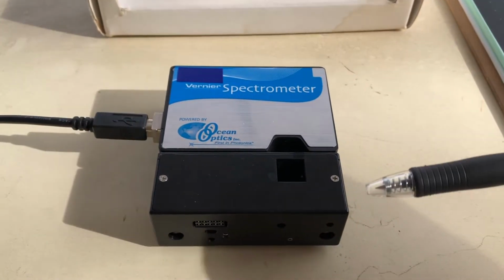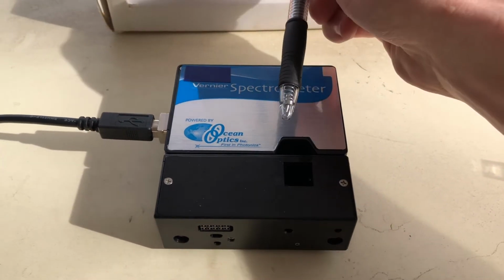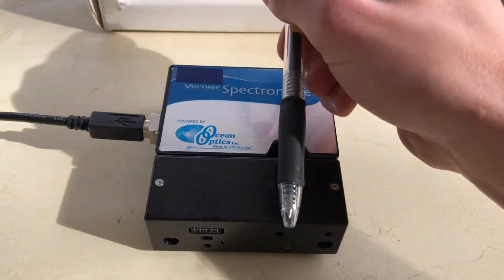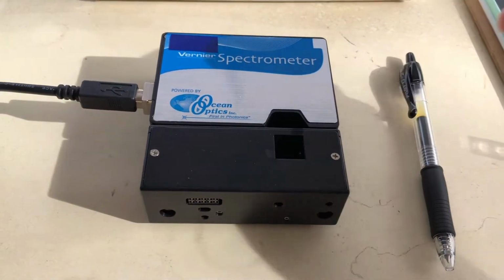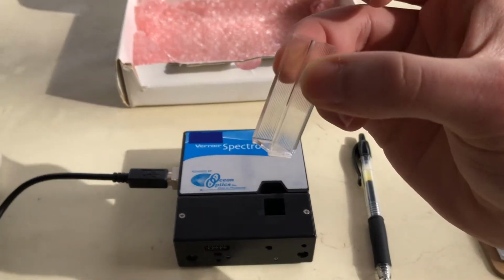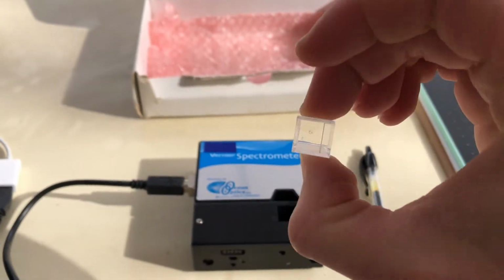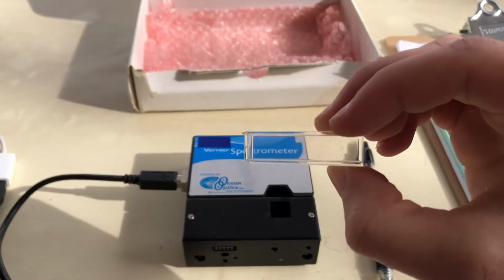And if this was on and plugged in, we would have a light source coming through this little opening right here. So it would be coming out in this direction that my pen is facing. And because it has this little hole right here for a sample, this is called a cuvette. So if you have a sample, you would be adding a little bit of solution into here. It's just a little plastic container that holds some liquid.